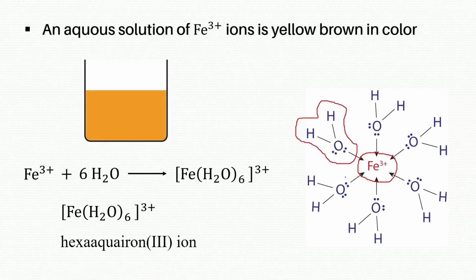The lone pairs of electrons on oxygen atoms of water molecules are donated to this Fe3+ ion, and dative covalent bonds are formed.